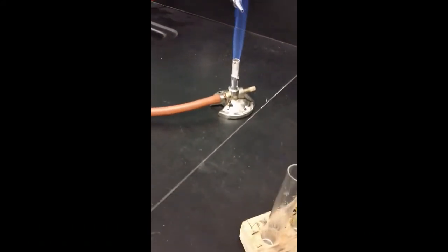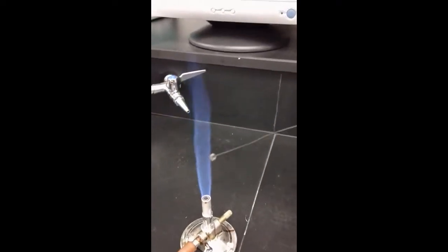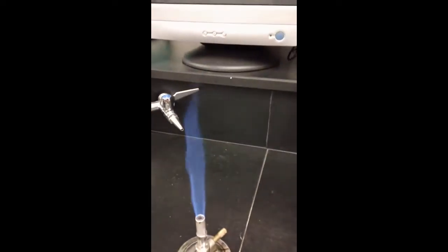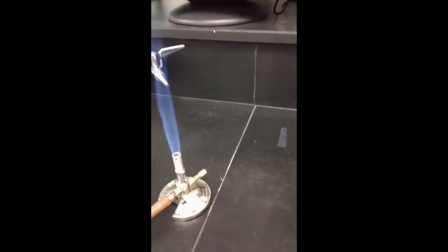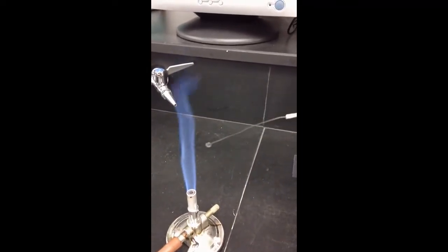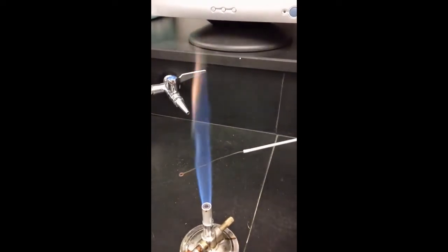Our very last one is K. So we have our potassium. K. Put the test rod in there. Make sure we have our loop full. Oh, notice that we have some sparks and some green. So again, I'll do it one more time. Full thing, pay close attention. This is K for test A. Okay.